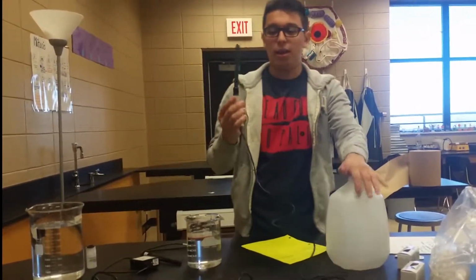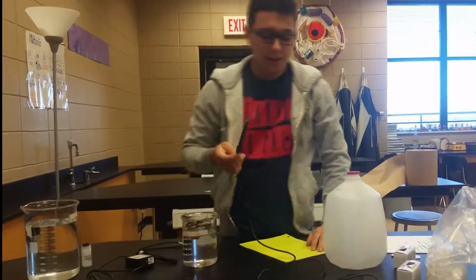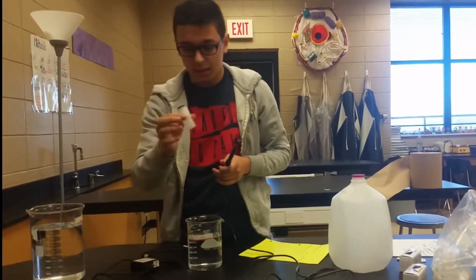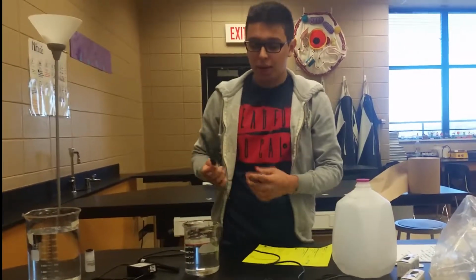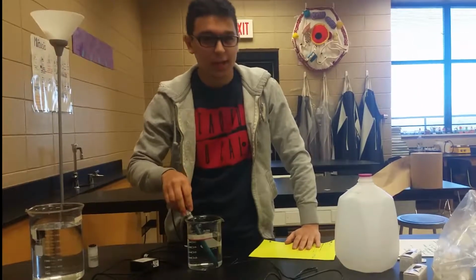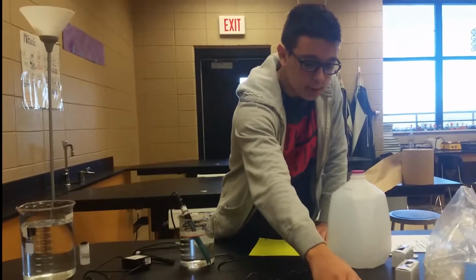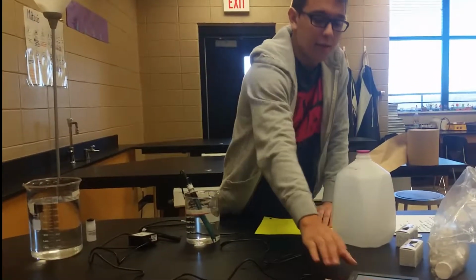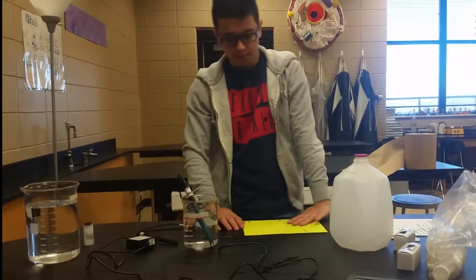So here we got the pH probe. I'm gonna call it the pH probe because that's what it is. And basically, what you do is you make sure after you take it out of this container, you clean it out with distilled water, and ours is already clean. So basically, you just set it in here, give it about 30 seconds to a minute, and wait for it to change. And here's where you see the pH start to change. And like I said, give it about 30 seconds to a minute, and you start recording that data onto paper.